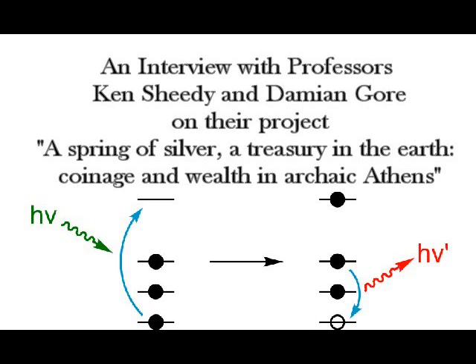Yeah. And we'll have a science question now. XRF is X-ray fluorescence, but for those of us who are not science geeks, what exactly is X-ray fluorescence? The technique involves stimulating elements in a sample, in this case using X-rays from an X-ray tube, and it's the same X-ray tube you might get in a dental X-ray. So it's about the size of your thumb, a little tiny tube.